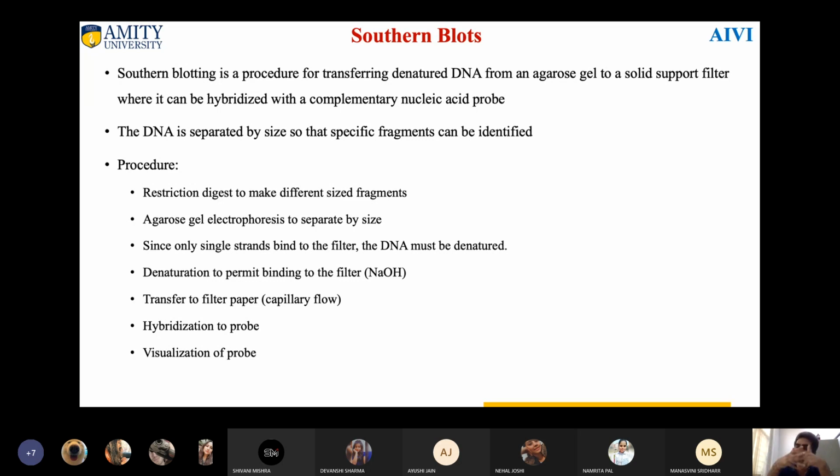In the mixture, it is not easy to diagnose where your fragment is, or whether it is there or not. You can do it in your mixture also. For that we utilize a dot blot, but that is not going to help you in identifying or isolating the gene. That's why the Southern blot is more specific. It tells you clearly what size of fragment your DNA sequence is on, and at that site what other restriction nucleases are present.